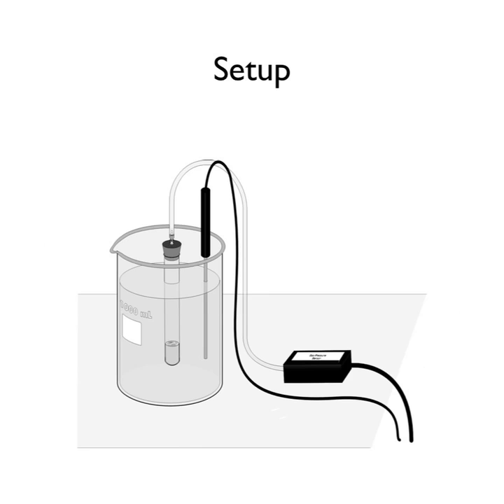Measure exactly 2 milliliters of 0.5 molar potassium iodide solution in a graduated cylinder. Draw about 1 milliliter of potassium iodide solution into a Beral pipette. Invert the pipette and immerse the reservoir end of the pipette in the water bath. Connect the gas pressure sensor to channel 1 of the Vernier computer interface. Use the plastic tubing to connect the one-hole rubber stopper to the gas pressure sensor as shown on this figure.